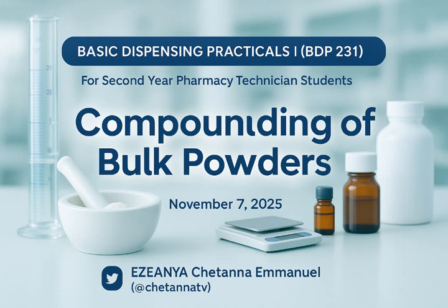But what of a situation whereby you see a particular ingredient, maybe the last one, you see "to". Let's assume you see "to", even though this amount does not fit in, but I just want to teach you something. If you see "to", they're not the same thing. The two statements are not the same thing. The first one, there's no "to" here, right? What it means is that you weigh exactly this amount, weigh this amount, and mix, right?